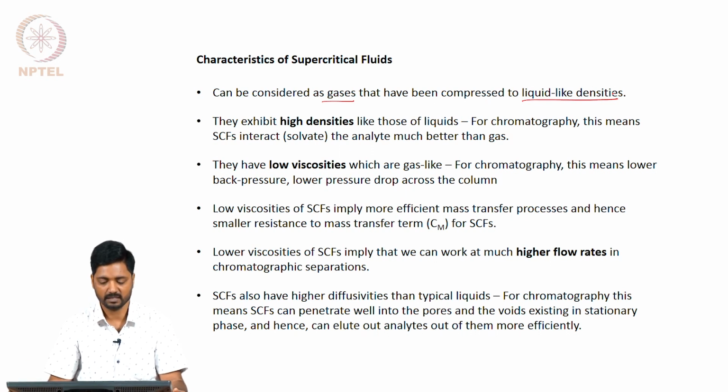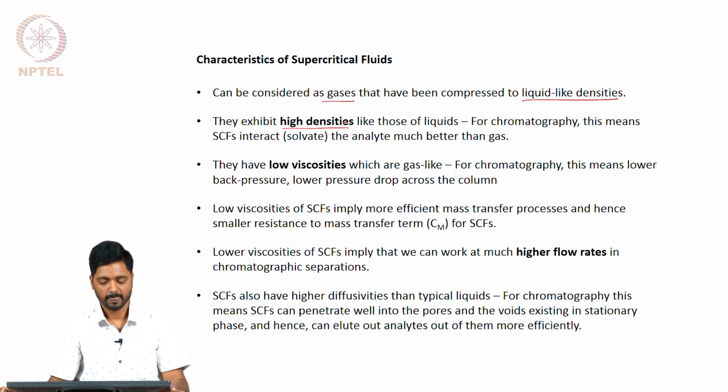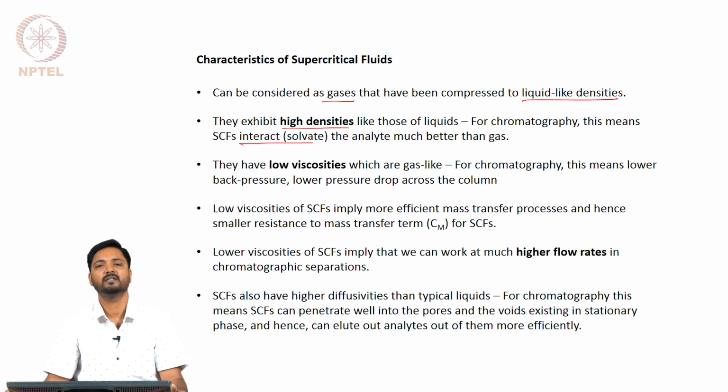We already saw that supercritical fluids have very high densities similar to that of liquids, and this is also mentioned here that they have high densities, and this for chromatographic purposes implies that the supercritical fluids can interact or solvate the analyte of our interest much better than a gas as the mobile phase. So, we can achieve enhanced solvation of our analyte when we are using supercritical fluids.